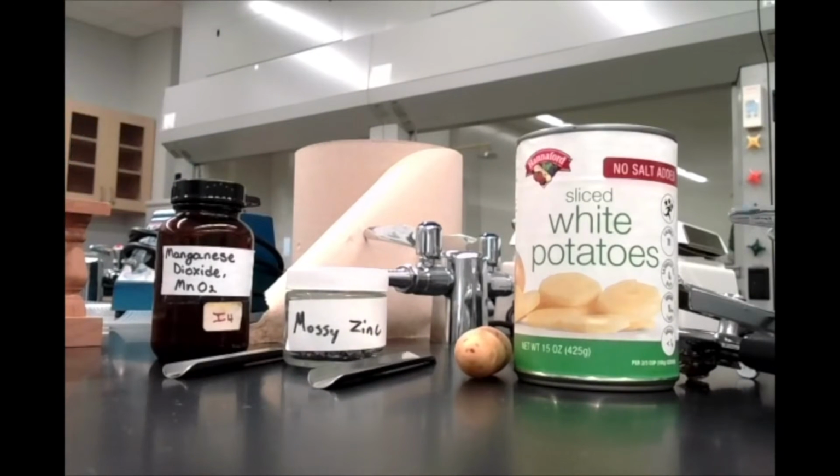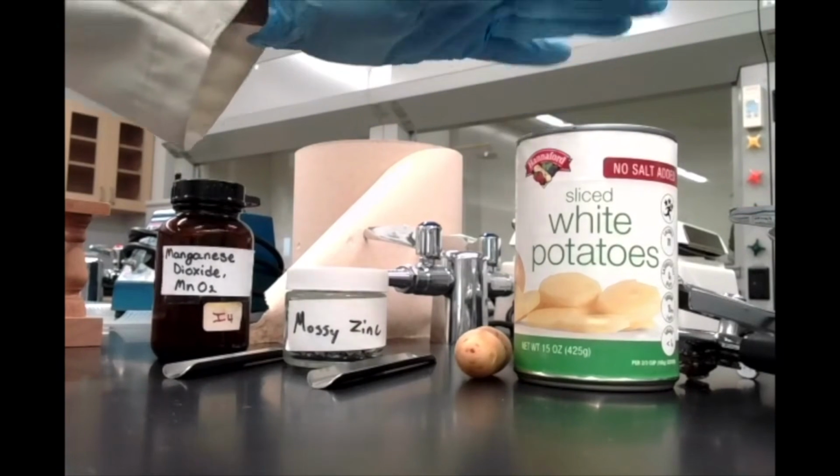Catalase is a protein that functions as an enzyme. If you've taken a biology course before, you've probably learned that enzymes are basically protein catalysts, right? They can catalyze reactions, speed them up, or carry out certain reactions. So catalase is one of these. We're going to see the effect of catalase on hydrogen peroxide to see whether it happens to catalyze that particular reaction or not. Over here, of course, we have some boiled potatoes.